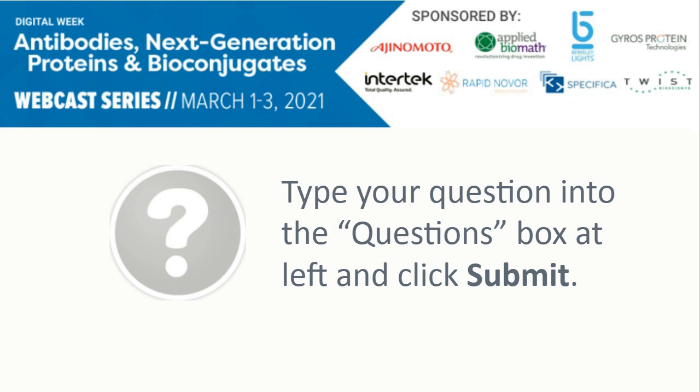This question also comes up sometimes: what would you do with the NGS data? One thing that we're keen to explore further is a more robust combinatorial approach. Once we have those positively identified hits from the proteomics data, go up and down the phylogenetic tree of the NGS and identify very similarly related antibody sequences, and just express those and see if you can deliver some more antibodies from those initial hits.